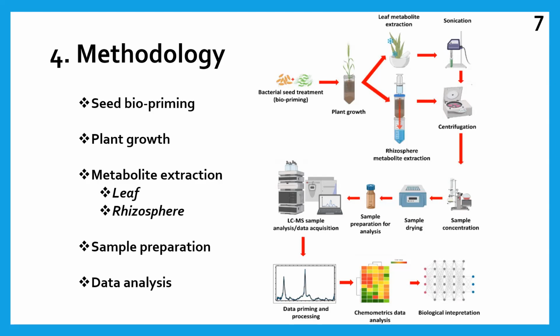So here we were more or less concerned with the metabolic profiles and the supposed changes in the metabolic profiles of the plants themselves. We were studying the rhizosphere initially, and basically how changes in that place can affect the metabolic profiles of the plant itself. But looking into the physiology of the plant as well, that would be a great step forward. But yeah, we're more or less concerned with the metabolic perturbations of plants concerning plant-microbe interactions, concerning PGPR actually.